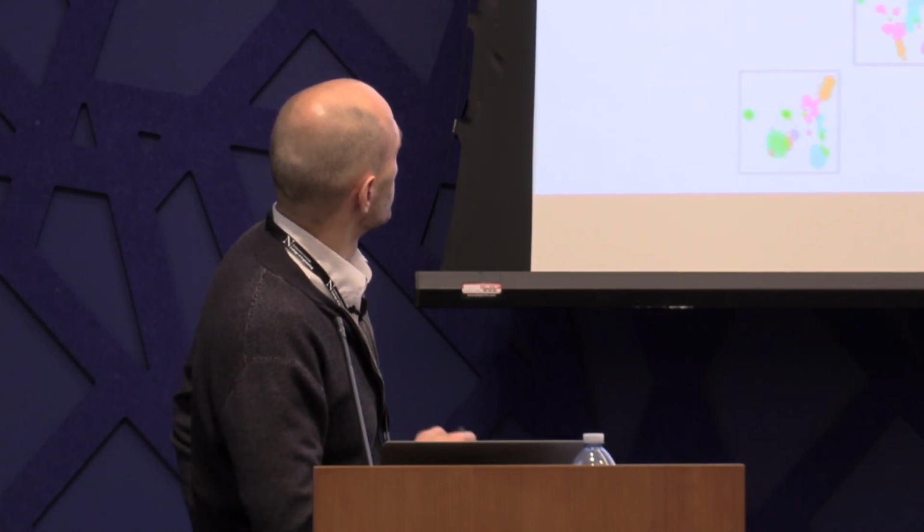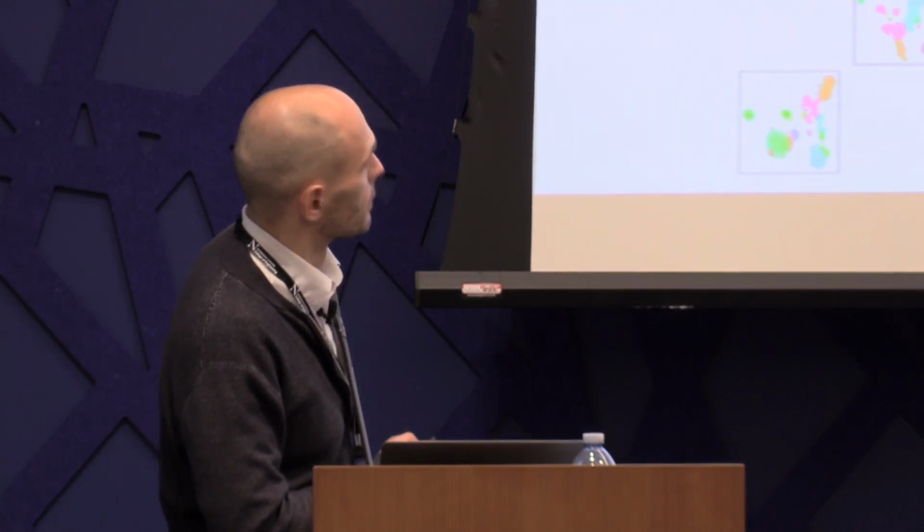And this is just following up on this bone marrow study, the example of how we use it. So this is the collection that we have from different fractions that were collected during surgeries and controls. And essentially, after you join them, you have this view of more or less uninterrupted hematopoiesis here. And then these are the tumor cells nearby here. T cells mature elsewhere, so they're detached essentially here.